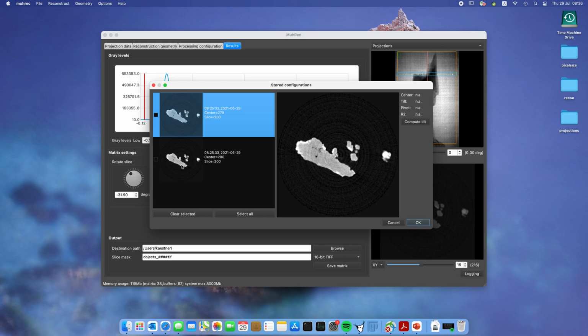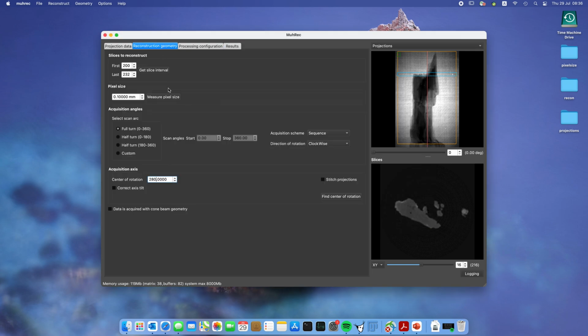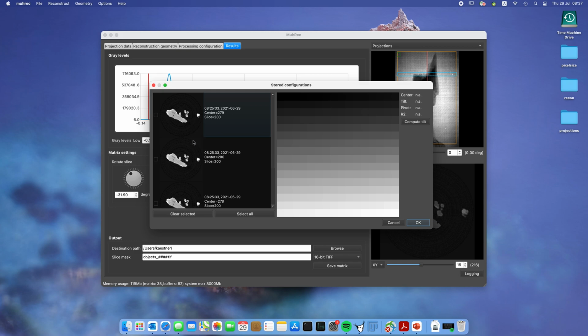And you can see that for a 1 pixel shift, there is already a remarkable difference in sharpness. So it's really important when you tune your reconstruction that you really pay attention to getting a little bit better all the time. We could even go one step further, doing maybe 78 and try what happens then. And we store geometry, go into the geometry list again. And now we know that the 280 wasn't really relevant.